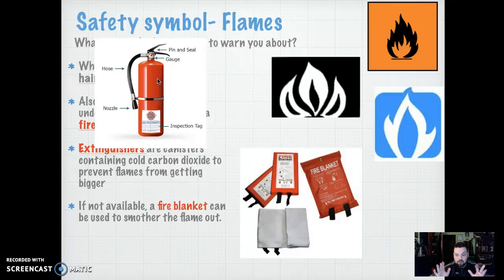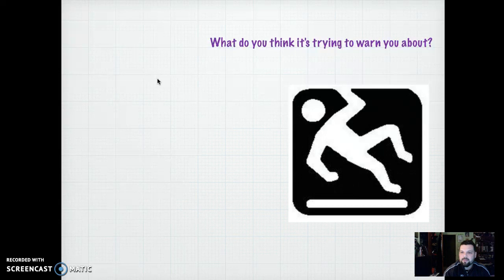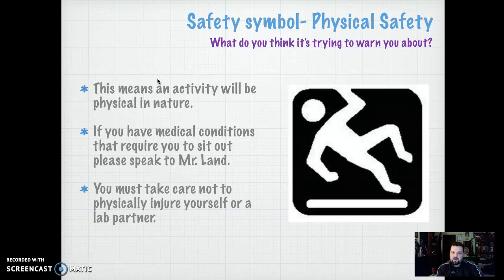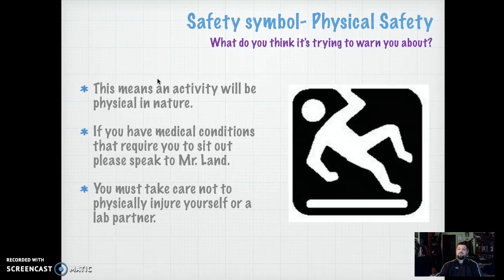How about this one? No, that doesn't mean I'm breakdancing. This one is physical safety. It means that an activity is going to happen and it's kind of physical in nature — like if I say we're going to go outside and do tug-of-war, and you have a medical condition and can't really pull that hard, you have to let me know. Tell me your situation so I'm aware. I do have labs where we go outside and do some fun stuff, so let me know if you're physically unable to participate.